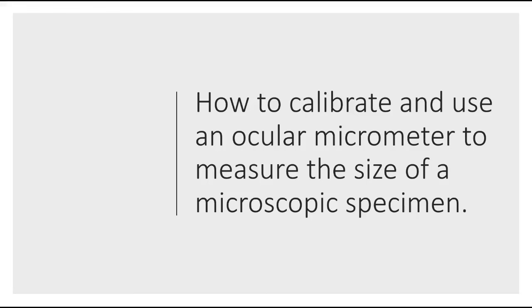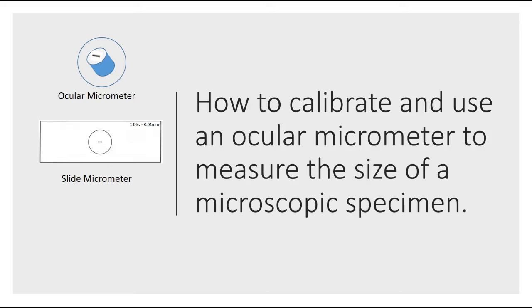Hi, I'm Gilles Bolduc and in my video I'm going to show you how to calibrate your microscope's ocular micrometer so that you can accurately measure the size of a microscopic specimen. You're going to need to use a standard compound light microscope that has an ocular lens equipped with an ocular ruler. You'll also need a slide micrometer and eventually a slide that has a specimen on it.